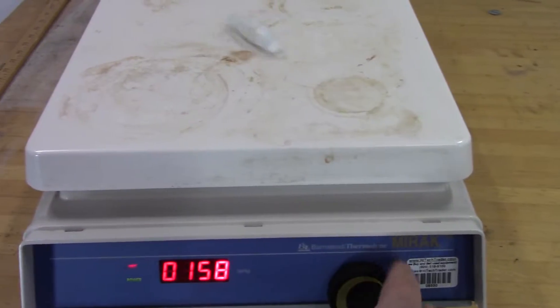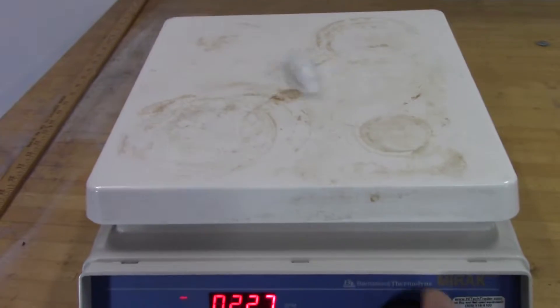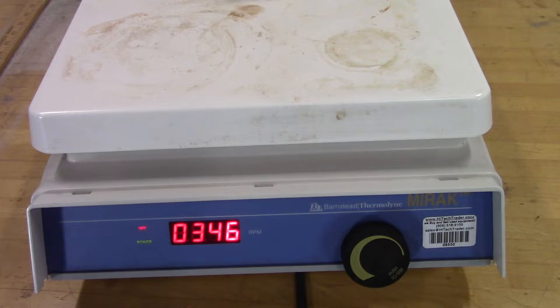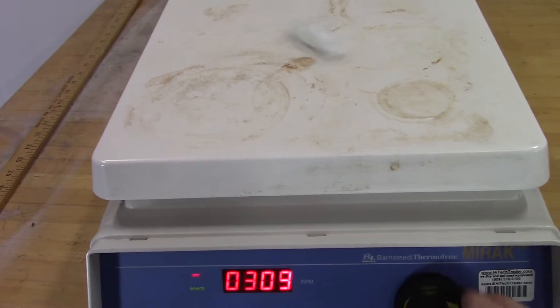Turn it up a little bit. See that increase in speed? It's going to spin off soon. Decrease in speed.